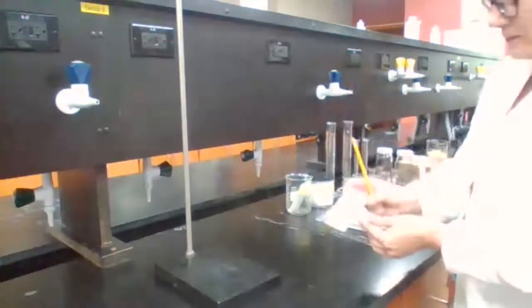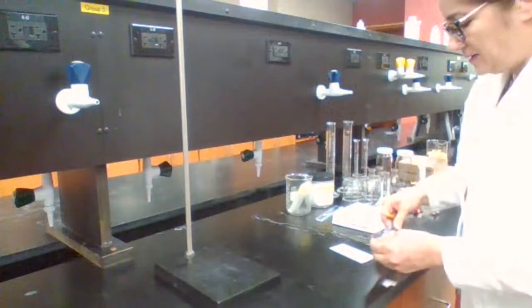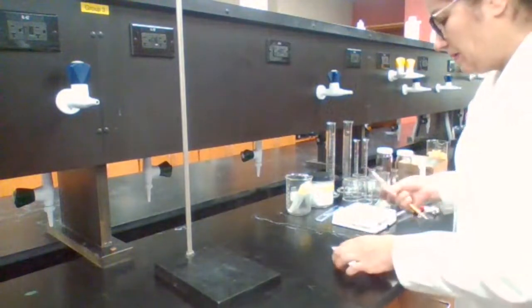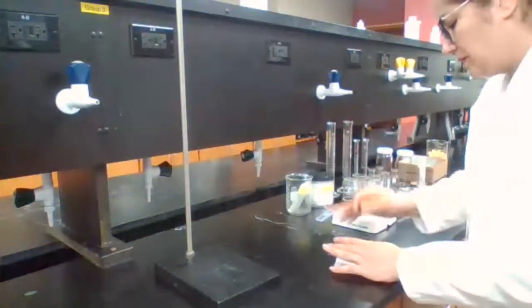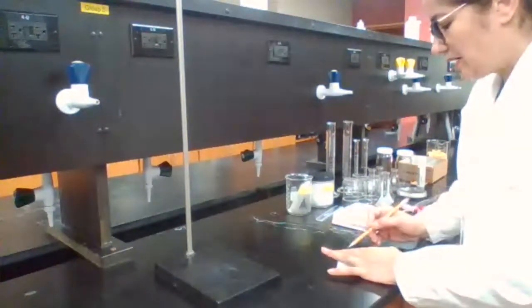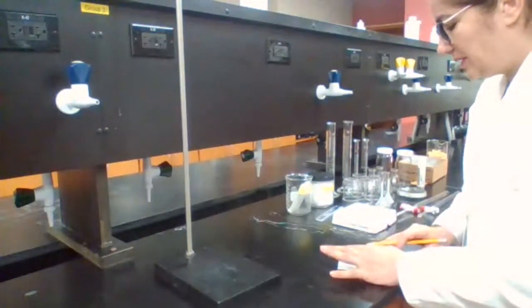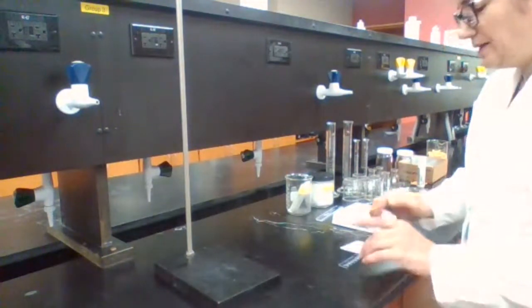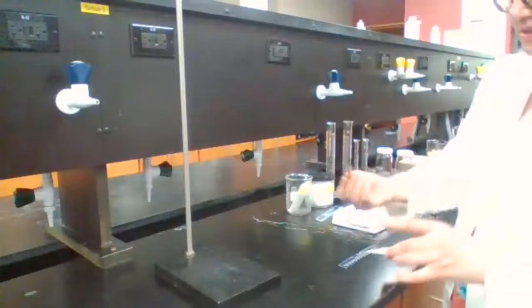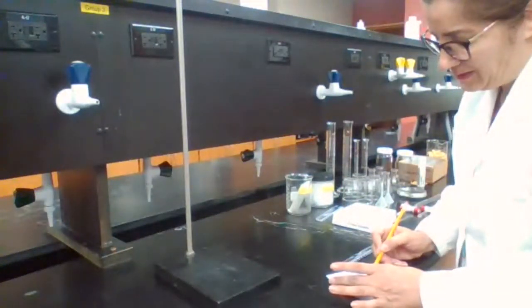So I'm taking a plate and, using a pencil, I'm going to draw very lightly on the plate a line, the sample line. I'm going to spot it very lightly.